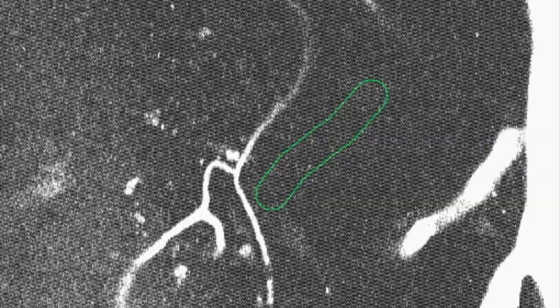As we see here, the green outline indicates this vessel piece here, and there's the black spot representing the red blood cells stuck right here. And I'll go up and down to demonstrate the fact that it's not moving. Another stalled beginner vessel. As we scroll up, we see the vessel indicated and the black spot not moving.